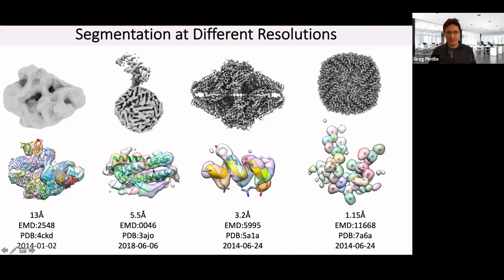So I thought to show this range of resolutions. As you might all know, the cryo-EM field used to be called blobology in the early days. And I still like to think of it as blobology, but now the blobs are smaller and correspond to atoms.